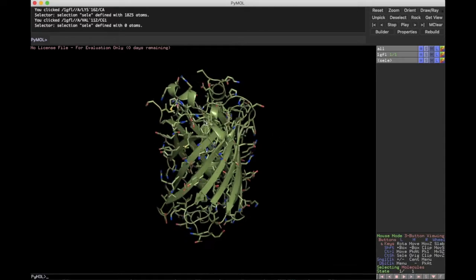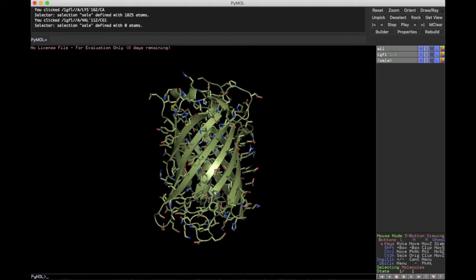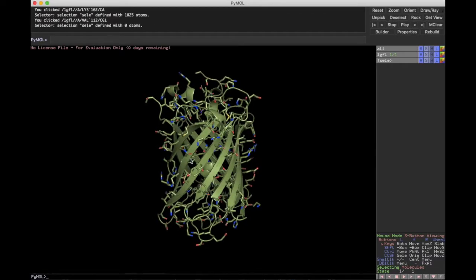If we look at the top and the bottom, we've got this amino acid side chain, which you could argue is the highest, and this one is the lowest. This amino acid is the most to the left and this one most to the right. We'll use those to get a better understanding of the height and the width of this protein.